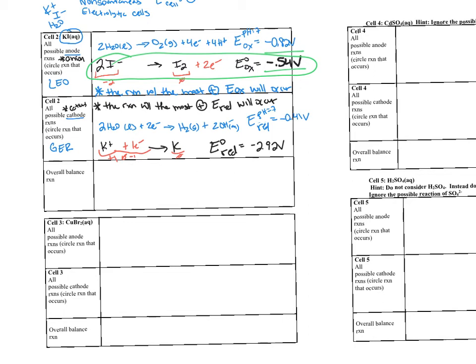And so in this case, we're comparing negative 0.41 to negative 2.92. And so in this case, water is the reaction that will occur. And when you observe this video, you should indeed see at the anode the oxidation of iodide, so probably like a red liquid forming. And at the cathode, you should see bubbles forming and the solution turn pink.